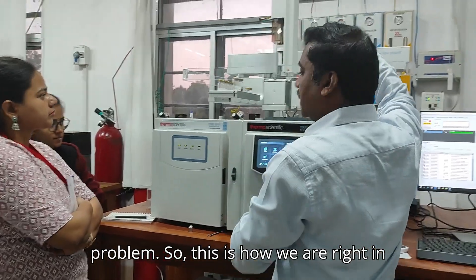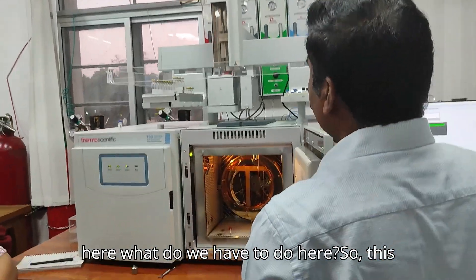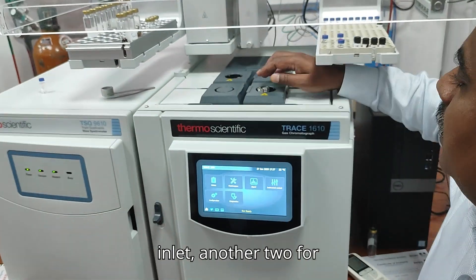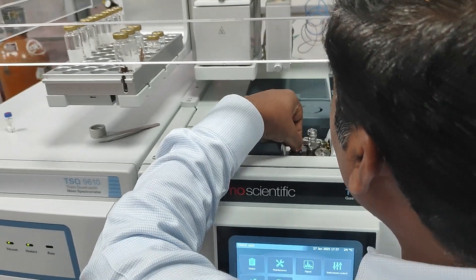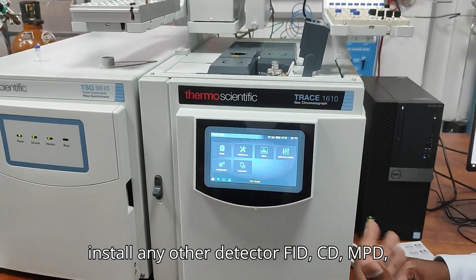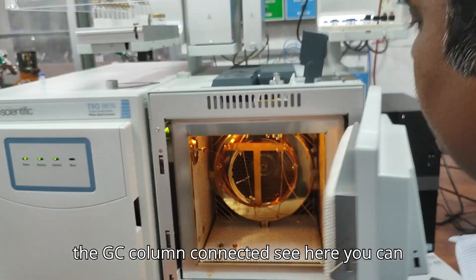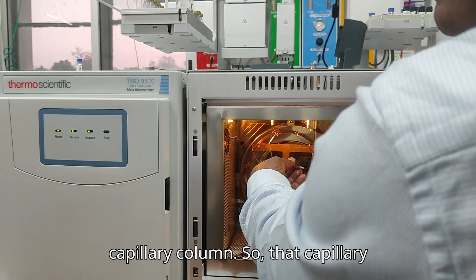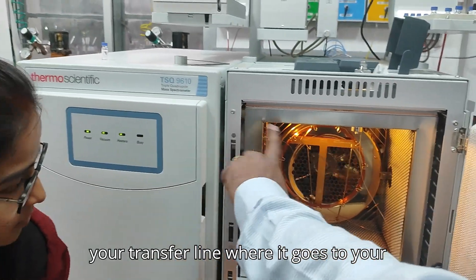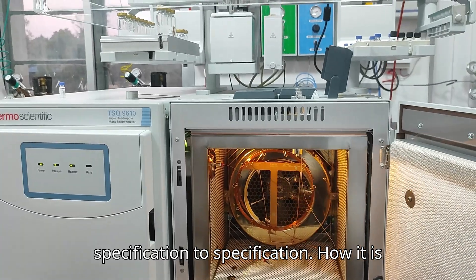Now, coming to the hardware. This is your GC system. On top you can see four ports — two for sample inlet and another two for the detector, such as FID, ECD, NPD, FPD, or whatever detector you install. This configuration is for without MS. When you have MS, a transfer line connects the GC column to it. You can see the capillary column — it should be connected to the sample inlet on one end. The other end of the column connects to your transfer line going to the mass spectrometer.